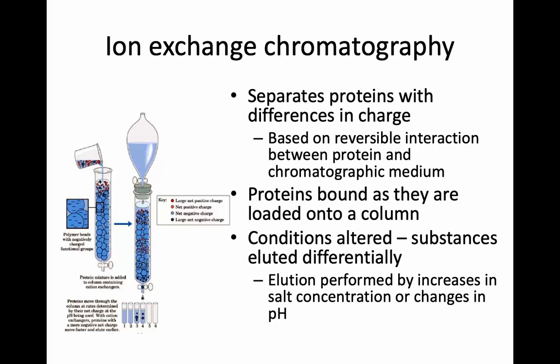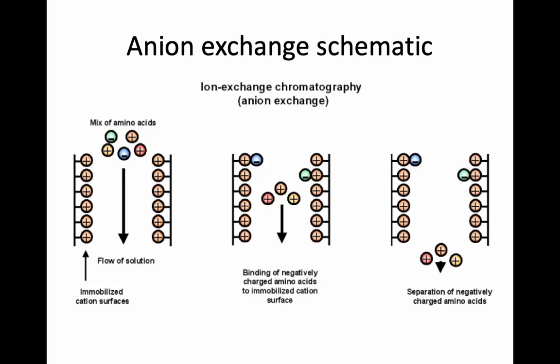As we have talked about through the class, we can use pH or salt concentration to adjust the parameters of your chromatography and basically increase or decrease the elution time or the elution volume of a specific molecule, because we know that protein charge strongly depends on the pH and the electric current that can be applied to a certain media.